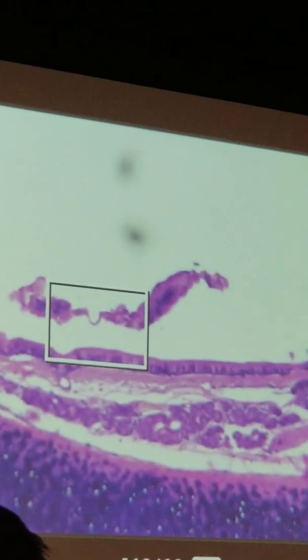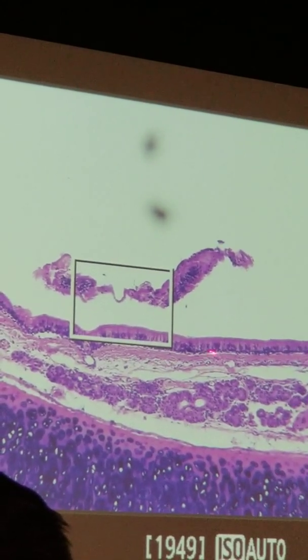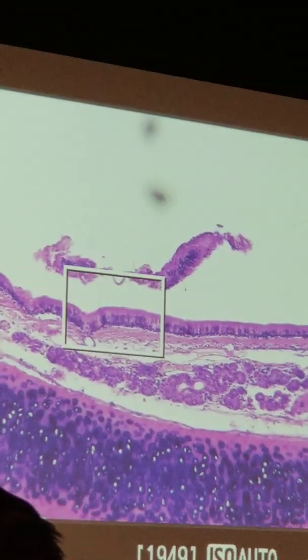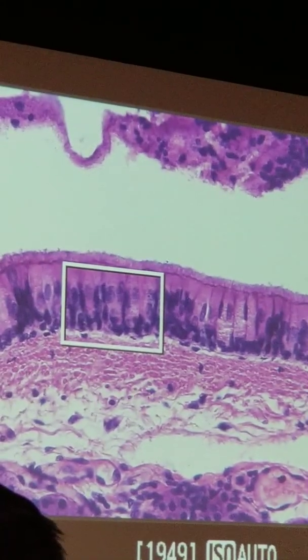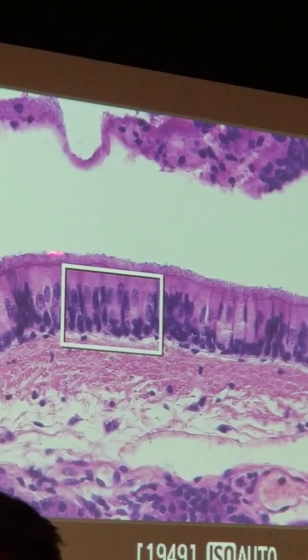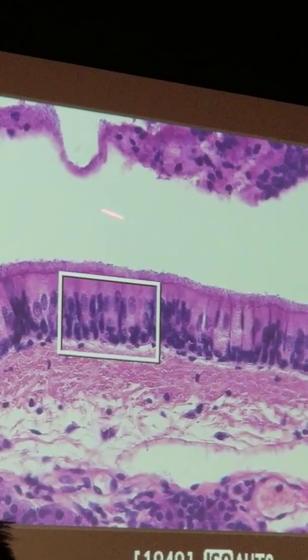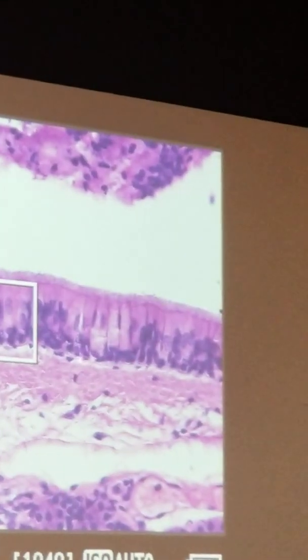All right, so we only want to look at that strip here with the pseudostratified, okay? So it's right here, so I'm going to move it up just a little bit. It's always good if you center it every time you change the magnification. And then we'll go to there, okay? Now you should be able to see some stuff, okay? What's all this fuzzy stuff on top? Cilia, right? So that's the what surface? Apical surface. So open space is the lumen. Here's the bottom of the cell.